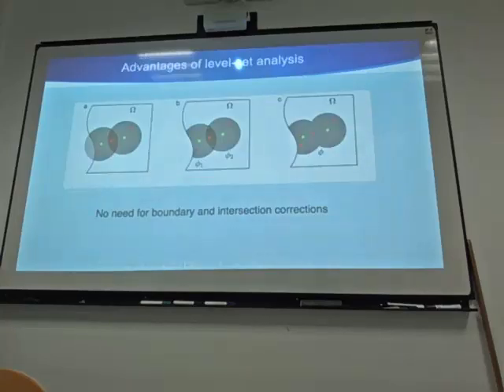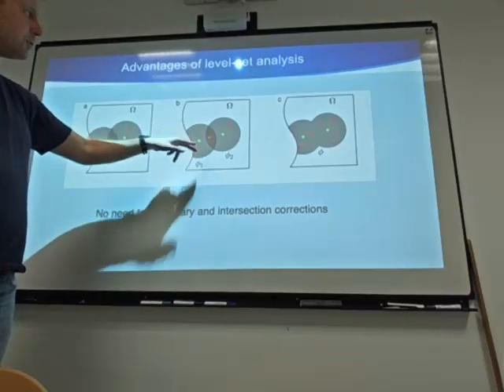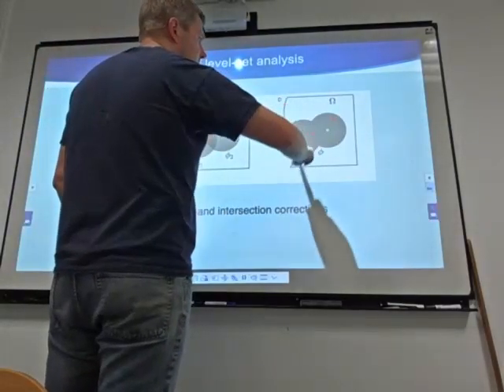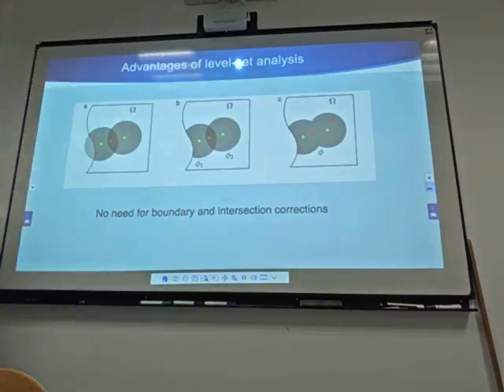And this is quite interesting because first, you don't have any more boundary correction. And second, this term of interaction, which is really a problem when you have a lot of molecules and a lot of coupling, you have no more, because then you have only one single level set that is going to map for each point the position to green objects in general. You don't consider individual green objects, but you just treat them as an ensemble, and you look at the distance of each red object to the ensemble of green ones.